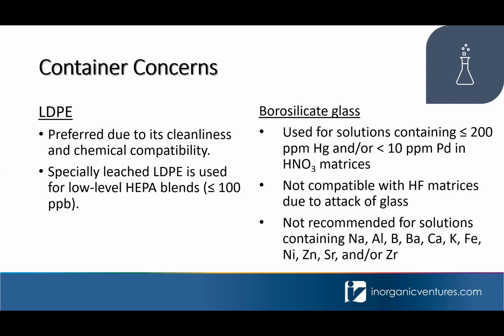These are solutions that contain elements less than or equal to about 100 ppb. When we're dealing with solutions on a low level, we prepare these in a clean room, and we also use these extra clean bottles. We have no issues with HEPA level blends containing common contaminants, calcium and sodium, for example, when we're using this process. So a clean bottle and also clean starting material are very key when you're trying to work in low levels.